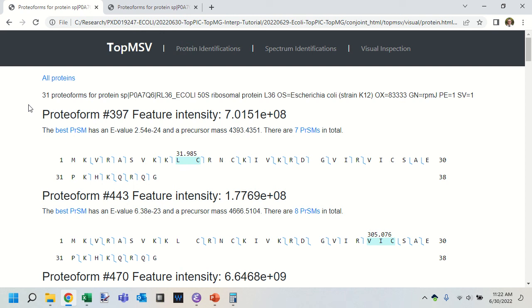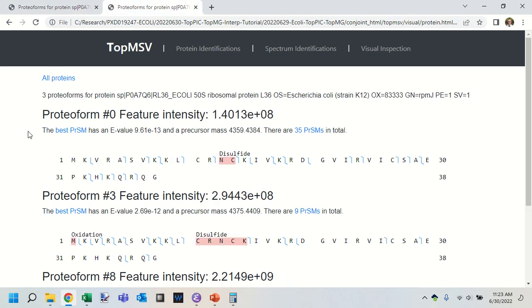Is the number of spectra that we saw for it different? Yes, in all likelihood, it was. So these are 2 very different search algorithms, even though they're working from exactly the same databases and, importantly, the same deconvolutions of the same input data. So we're able to look through this and ask whether the proteoforms we see are conserved between the 2.